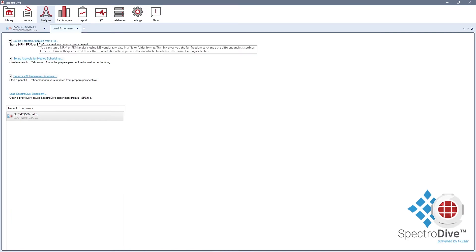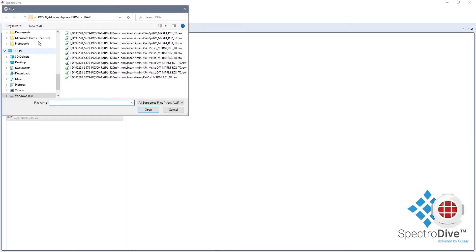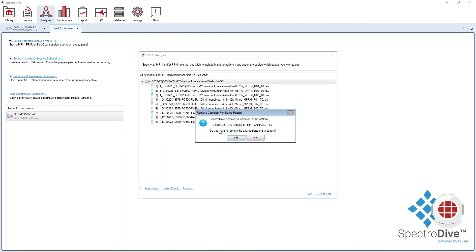When you select the workflow, set up targeted analysis from file, a wizard will open and it will guide you through all analysis settings. Start with selecting your PRM runs.